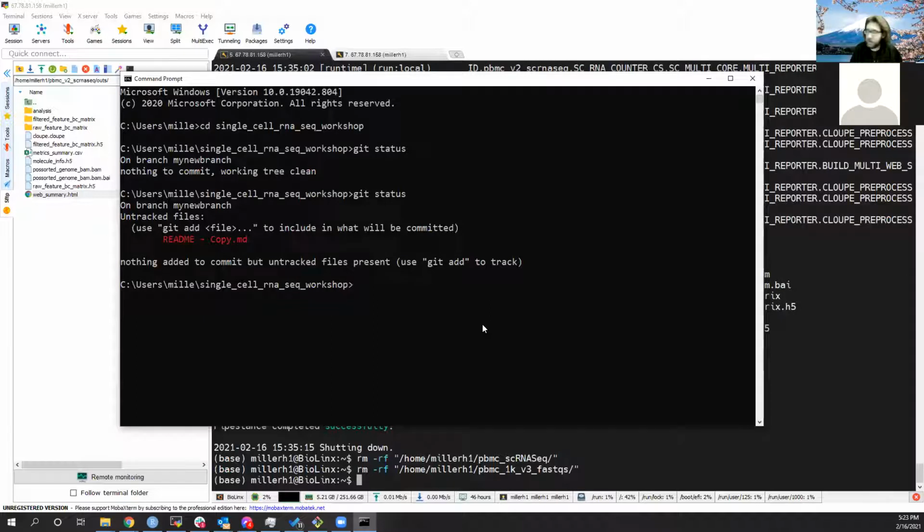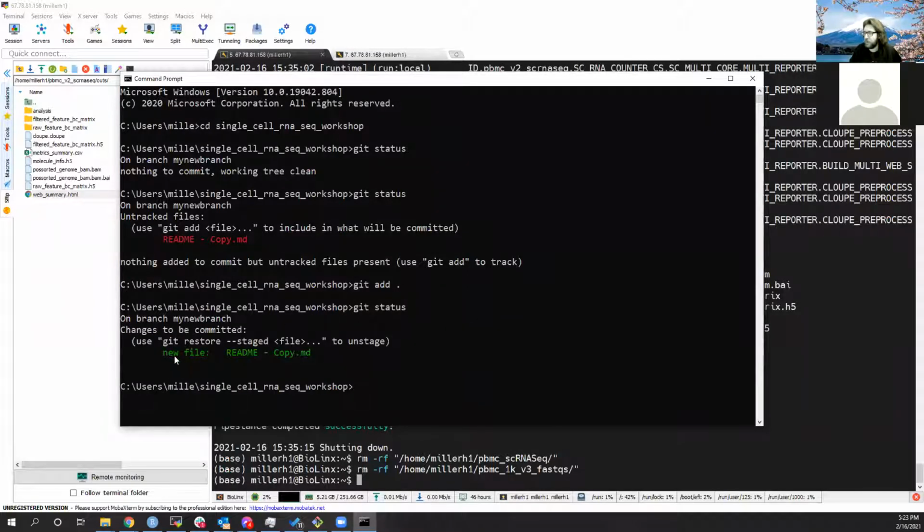So let's go ahead and do that. Git add. And I just typically write git add all. So that's what this means, git add all. It's going to add all the changes that you've made in the branch that you're currently in. So it's going to register those. So let's go ahead and type git status again. And now we can see we have basically registered this. I think the proper term is staged. You've staged this. Again, I'm not a Git expert, but I know enough to be functionally capable with it.